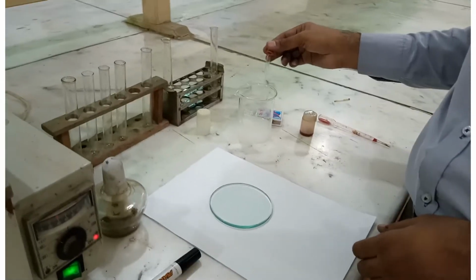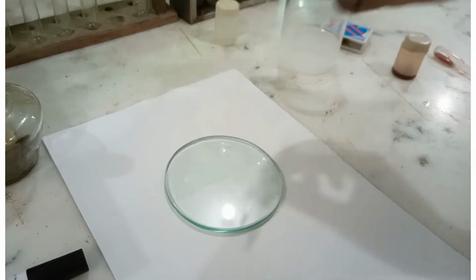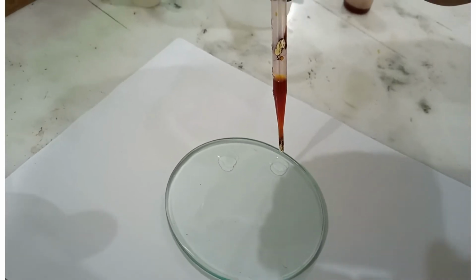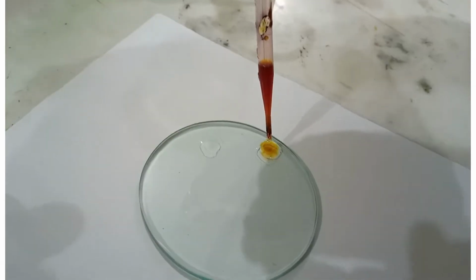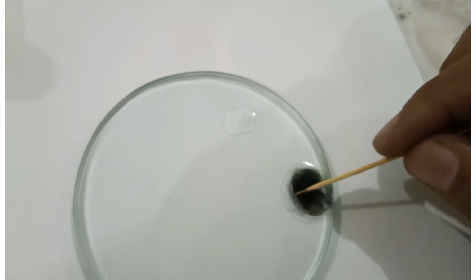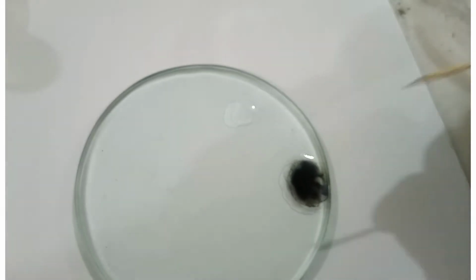We are going to perform the starch test by using a drop of starch and applying a drop of iodine on it. So we can see a deep blue or black color appeared. This shows that starch existed in this solution.